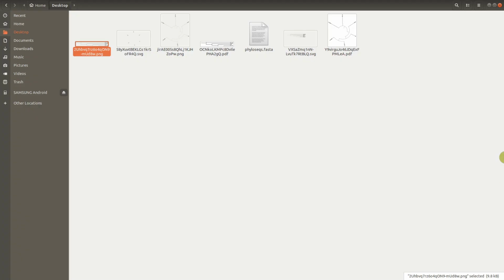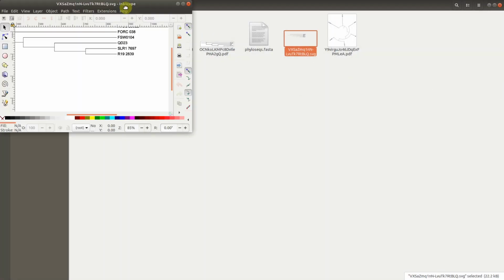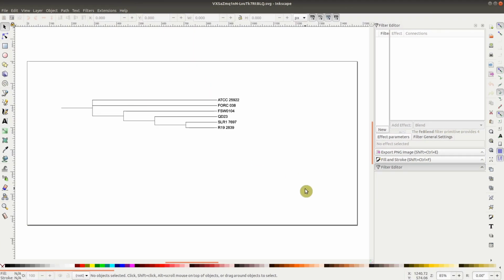Let's open the SVG. SVG is vector graphics. Okay, so let's do it for the rectangular. You can use tools such as Inkscape to open it. I already have Inkscape installed, so I can open it. So there's the SVG. When you have the SVG format, it's easy to manipulate and do editing on the downloaded image. So here I have it as it was.